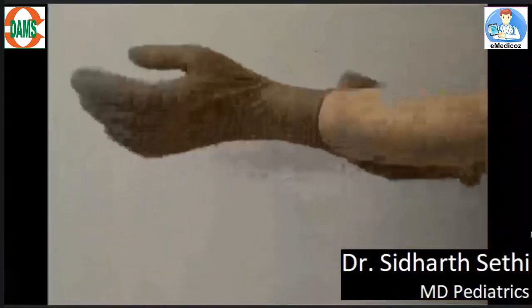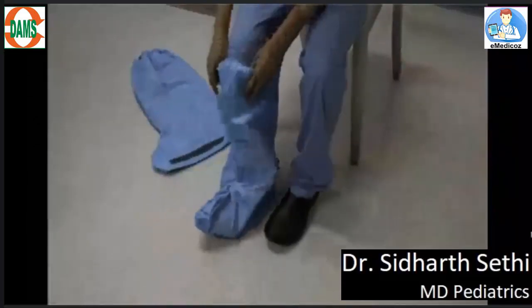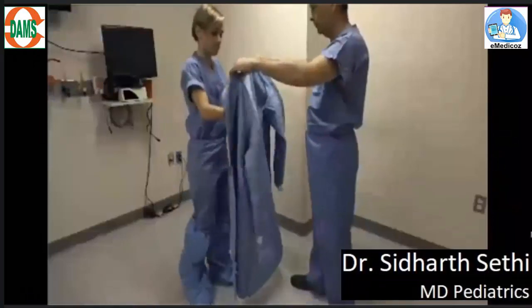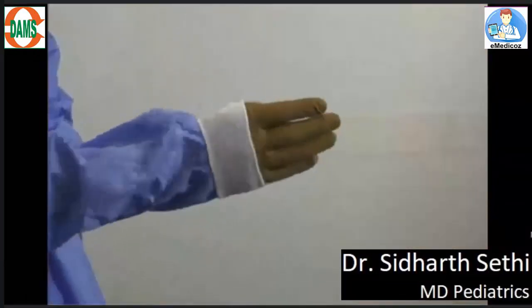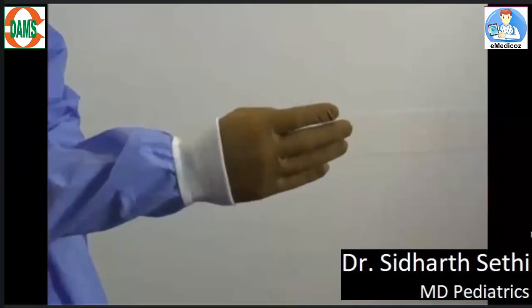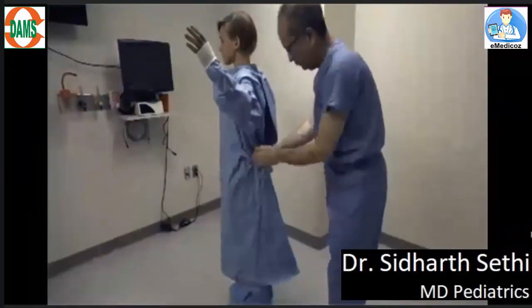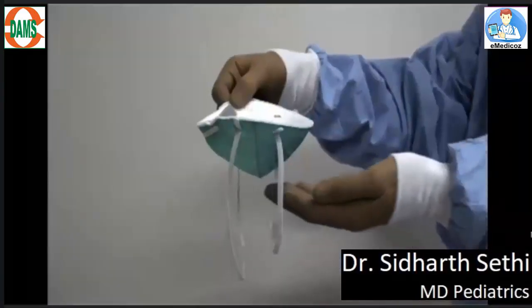Clean your hands with an alcohol-based rub. Wear the first pair of gloves — this is called the inner gloves. Now wear the boot covers. Now wear the gown, ensuring that the inner part of the gloves remains below the sleeve. Ask your observer to tie the gown for you.